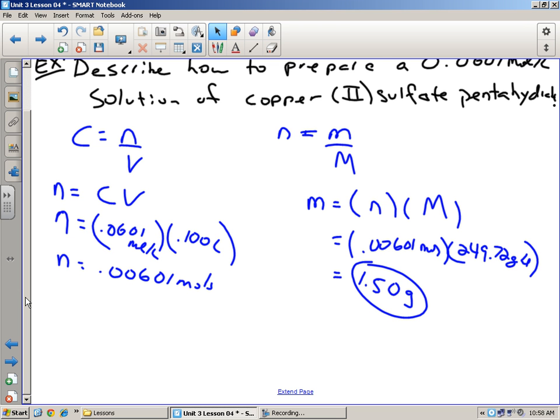So now it's reading zeros. We're going to need, obviously, copper 2 sulfate pentahydrate right here. It's a pretty blue. You'll need some distilled water. You need a scoop, in other words, to dig out the solid with. And then you'll need something to weigh it out in, because right now, of course, we just have an empty scale here.